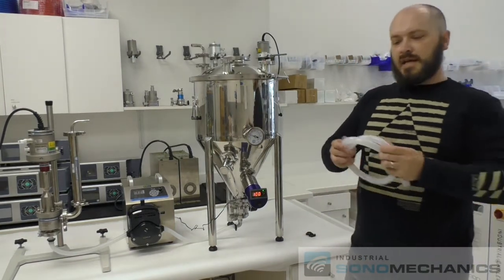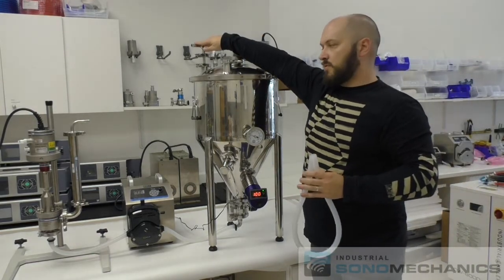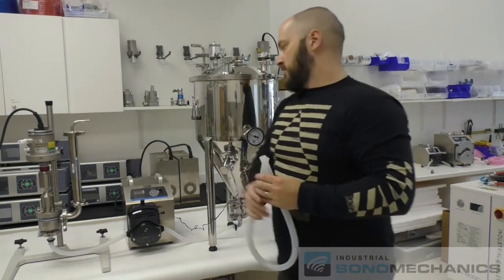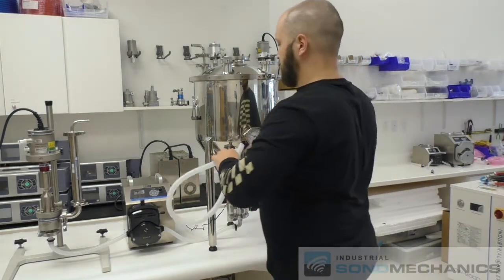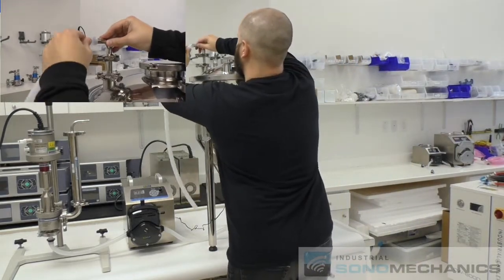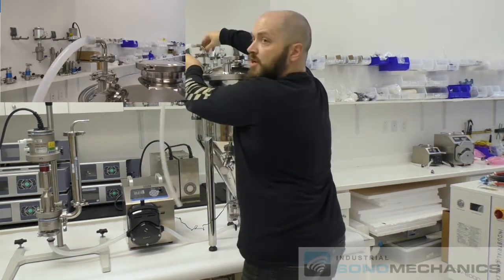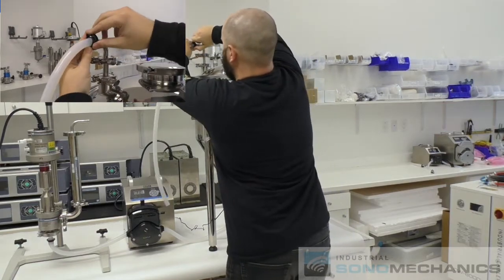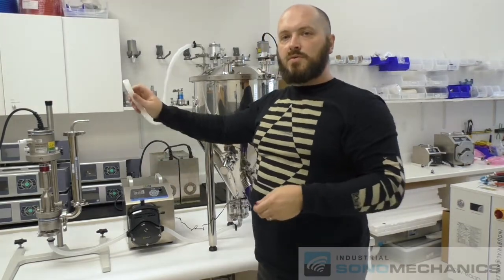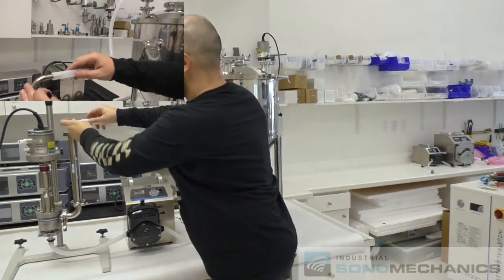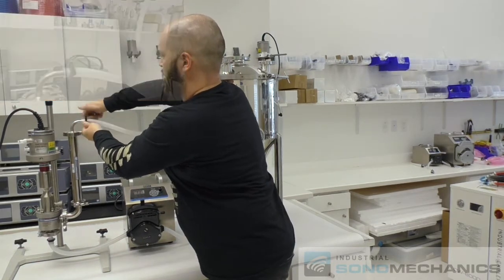The last thing we're going to do is we're going to attach the return hose from the return port to the ultrasonic stack heat exchanger. We use a clip to secure it. We grab the other side of the hose to the heat exchanger, secure it with a clip.